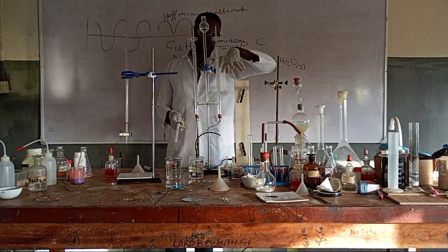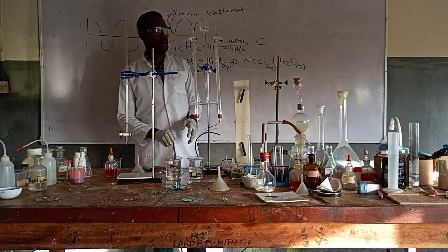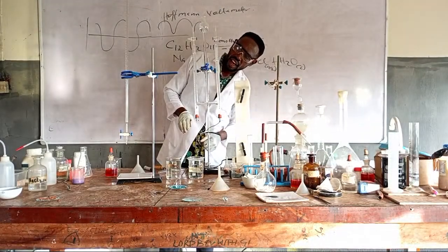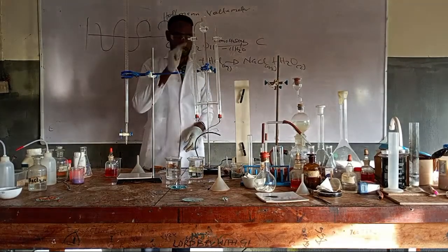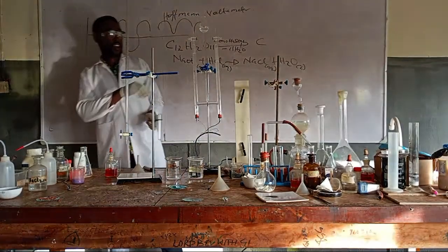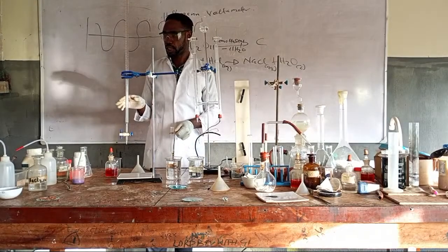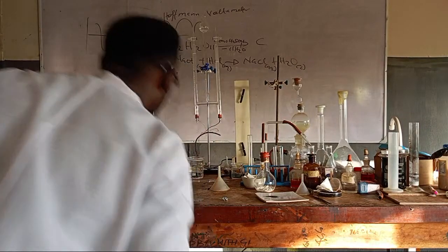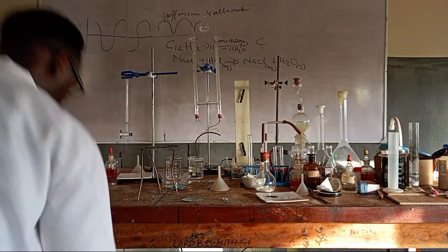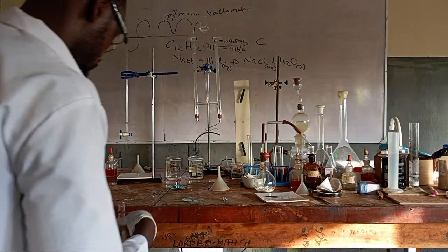But we want it to move down a bit. This apparatus is a bit faulty. But let me wait for it to reach about 16, then I will collect the gas. Remember, if I collect this one without collecting this, the ratio will no longer be the same. It will no longer obey the ratio of 2 is to 1 by volume. It was Antoine Lavoisier that first confirmed this fact.